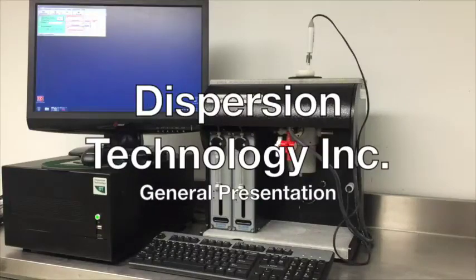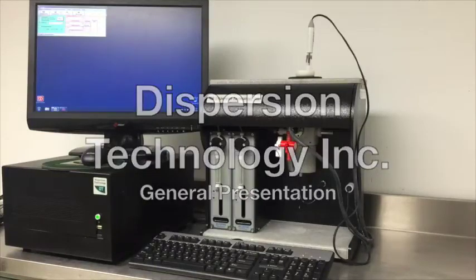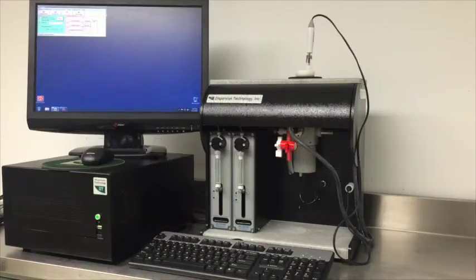This video presents the general features of the hardware and software, as well as sample handling procedures for the dispersion technology instruments. These instruments are designed for characterizing concentrated dispersions and emulsions without the need for dilution. There is also an option for characterizing some properties of porous materials. What you are looking at now is the most general setup of the DT1202, which contains all options.